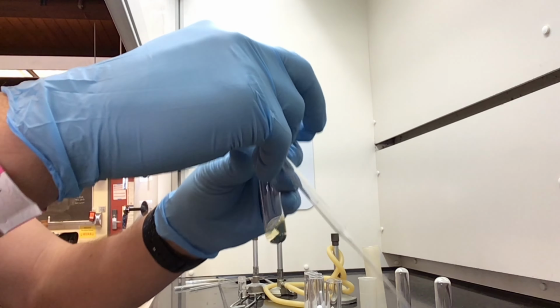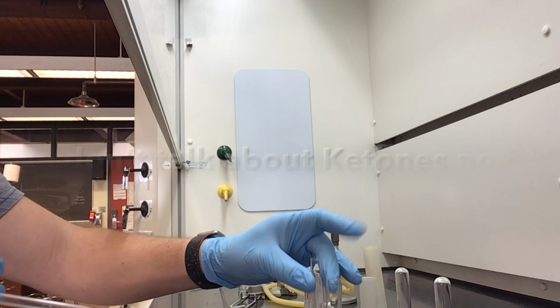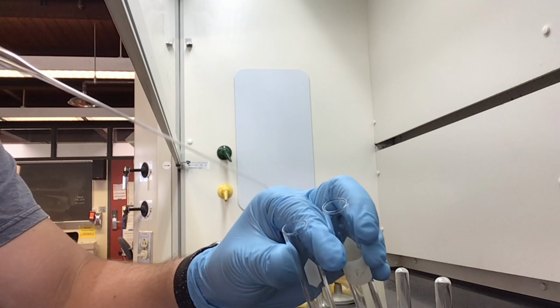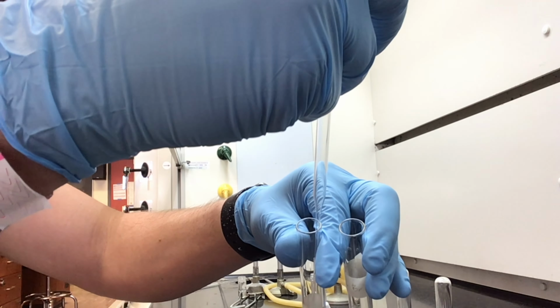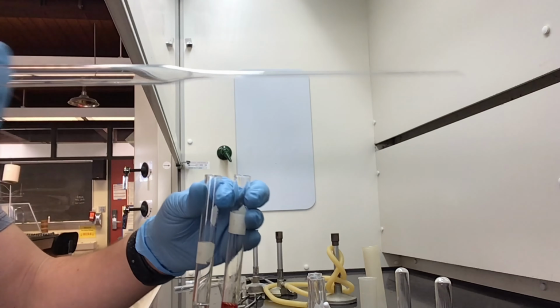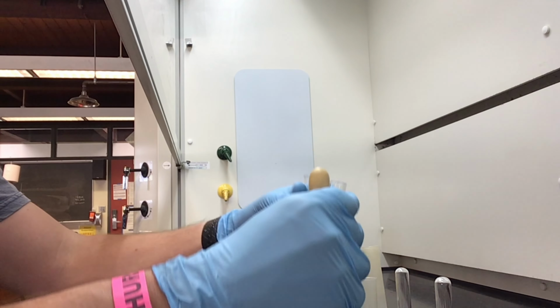All right, let's try the next compound, but hush real quick, because we don't talk about ketones, no. Okay, but yeah, for real though, we do talk about ketones, and we got to test that.